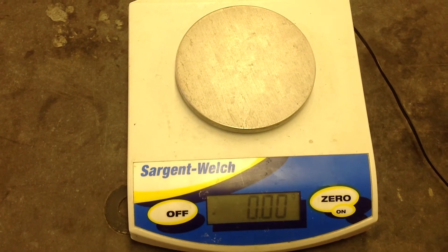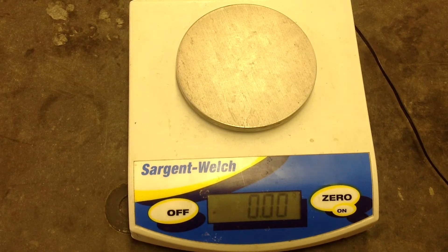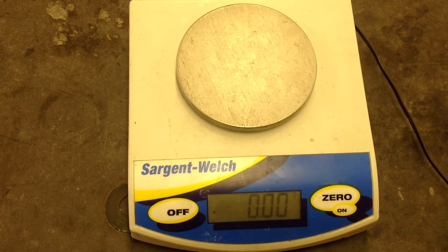Today we'll be performing an experiment, experiment 2.1, the mass of dissolved salt. The problem in this lab is: does the mass of salt and water change when salt dissolves?